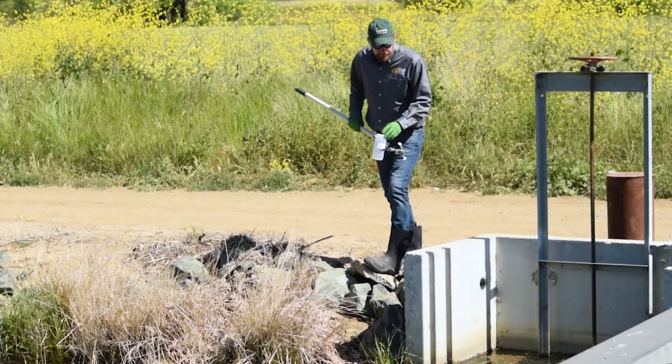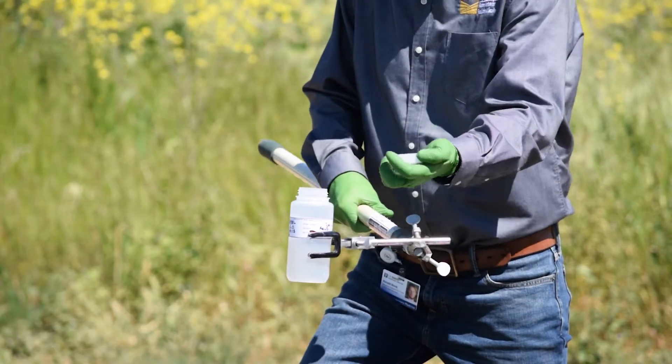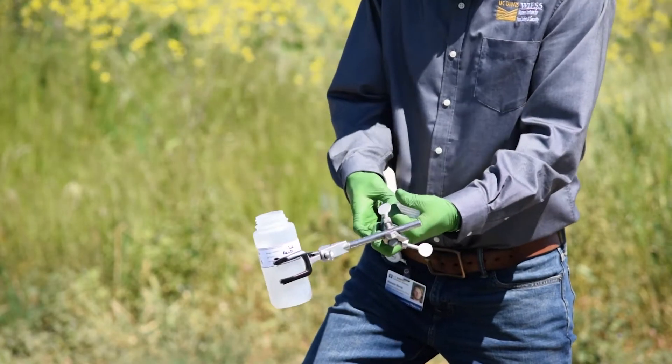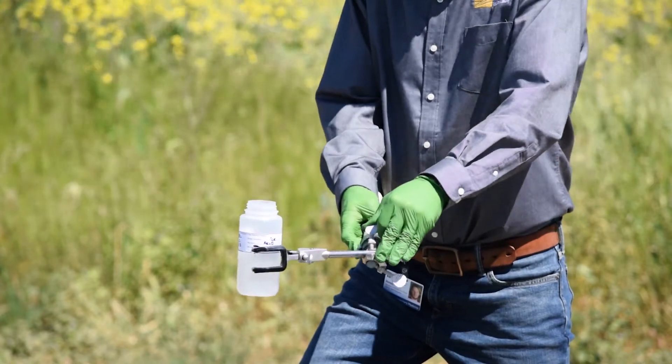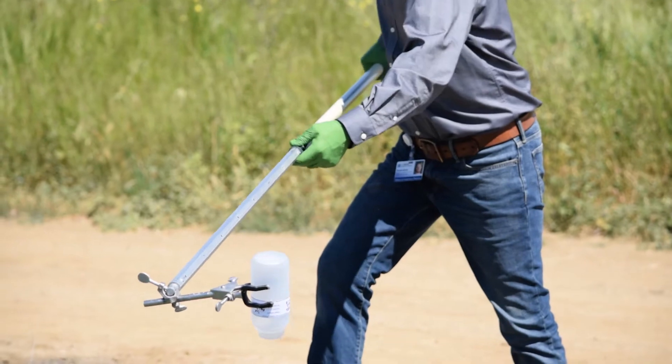Stand near the edge of the water and remove the bottle cap. The lid will eventually come into contact with the sample, so don't touch inside and don't set it down. Hold the bottle facing neck down to protect it from contamination.